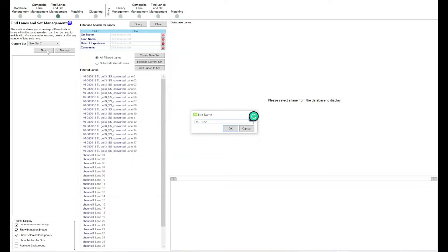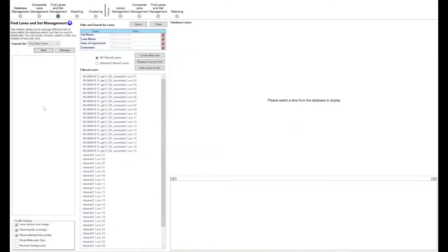Let's call this 'YouTube demo.' On the left-hand side within this box, that's where the lanes in this group or set will be held. In the center is all of the lanes currently in my database. My database is not particularly large, but if it were, you could use the functions at the top to search — by name, drug treatment, gel, date, lane name, or any comments added to that gel or blot image.